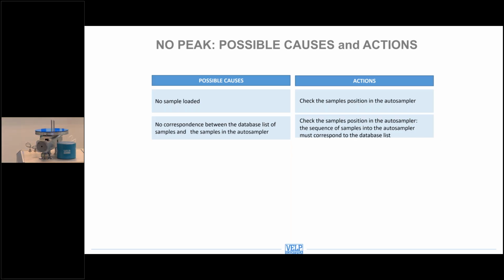This is very important because if you don't start from this position, no sample will be loaded inside the combustion reactor, or worse, the wrong sample will fall inside the combustion reactor.